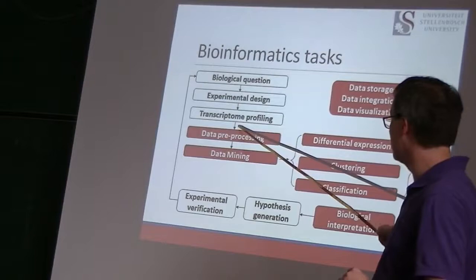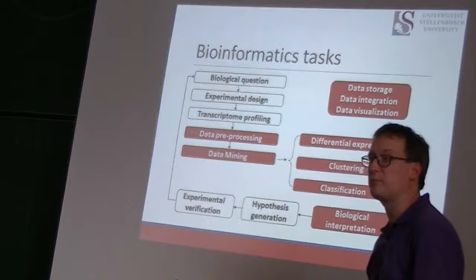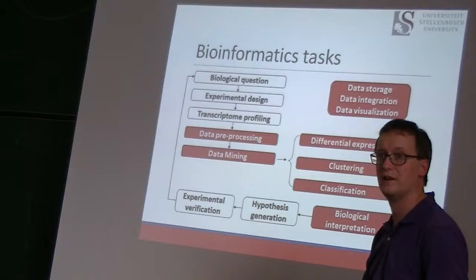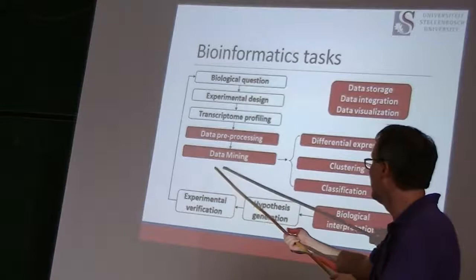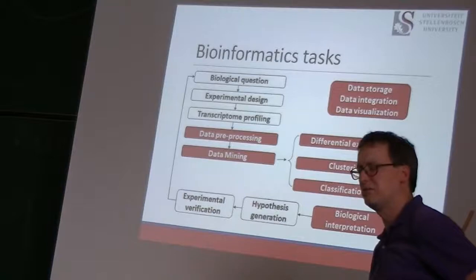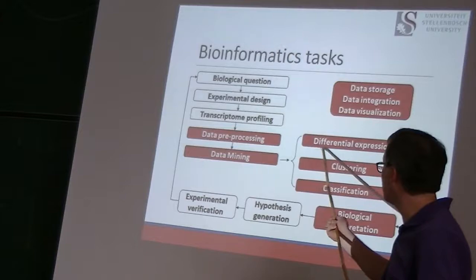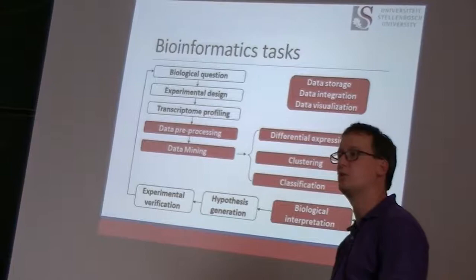We're going to do some microarrays. From this stage, everyone's going to have to do some amount of data pre-processing. This morning we used logarithms to normalize the data that were coming from the microarrays. That is an example of data pre-processing. And then data mining comes. What does data mining mean? You know, in the old days, we would call this data mining. Today, we might call this a big data exercise, but that's okay. We'll leave this at data mining, which is a little bit dated as terms go. There are very many different ways that you can make use of these data, but we can start with differential expression. We have two cohorts. We want to know which genes differentiate those two cohorts. Clustering.